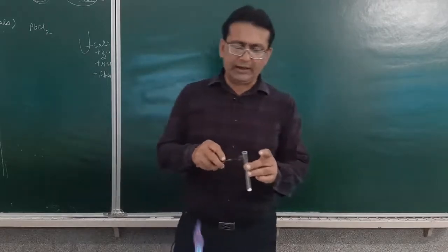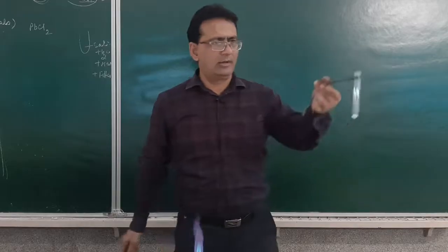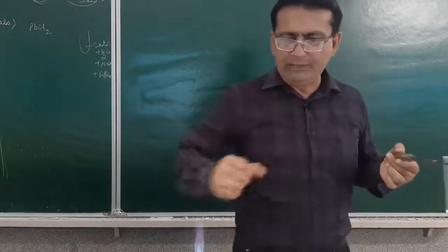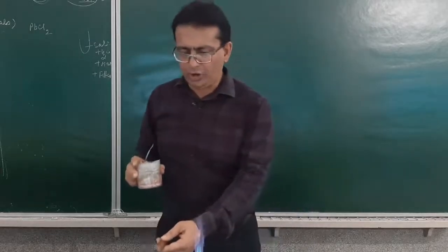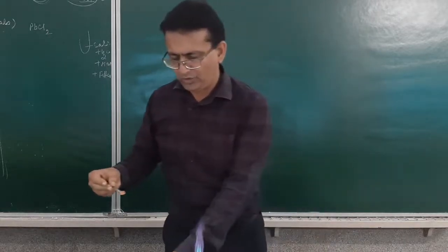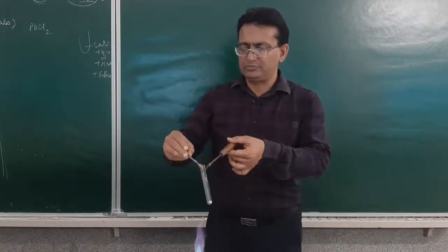Just see how I identify the tests. Into this, I will add a bit of copper turning. This is copper turning, and it will be added to the salt.